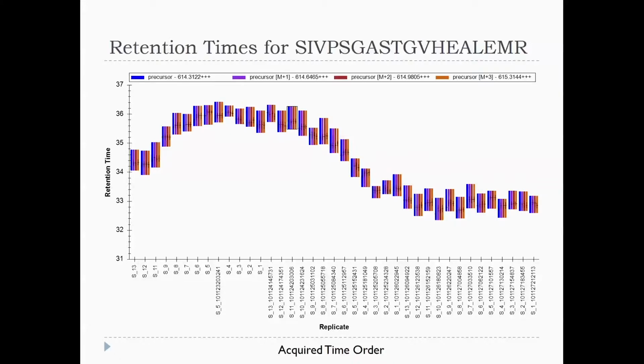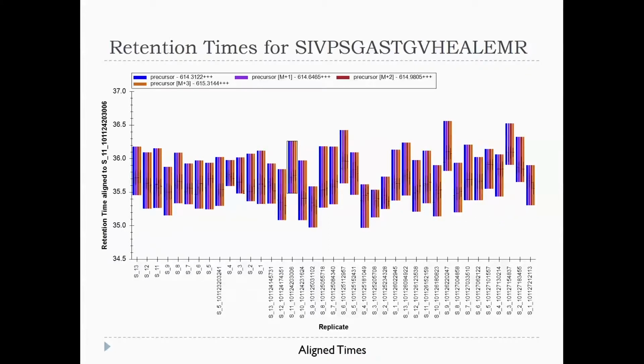And so there's some drift here. And it's moving. But I would say, in general, this is not surprising to me as long as these things kind of overlap. But I would really rather see it go straight across. But that we can get by doing alignment, yay, and there it is, aligned. So yeah, that's not IRT alignment. That's alignment. This is DDA data, and we just aligned by the ID. So the alignment has been around for a really long time. IRT is newer, but we just did normal alignment here.